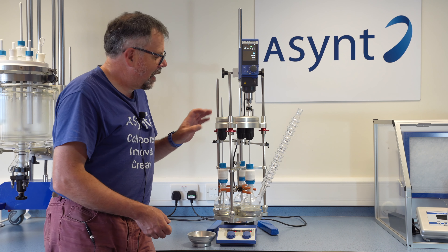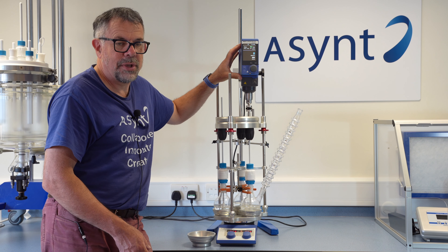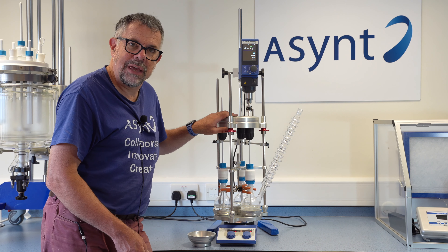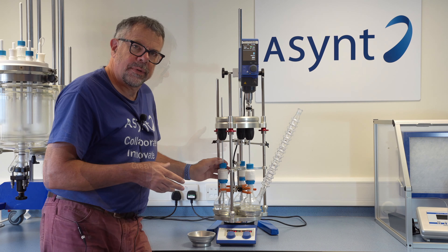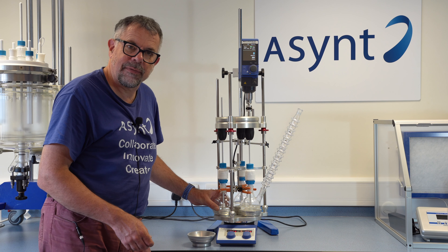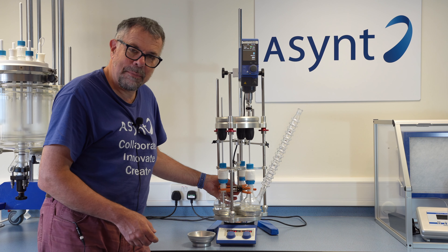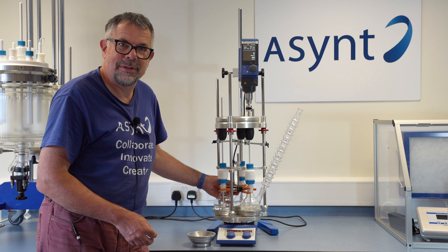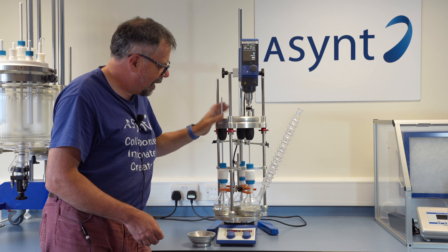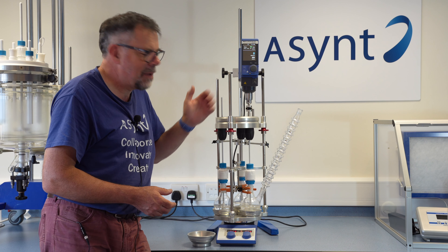The main thing about Vortex is it's a direct drive overhead stirrer. Basically, you can utilise a standard overhead stirrer motor, but instead of stirring just one reactor at a time, we have a heavy duty gearbox that allows stirring of three at a time. Vortex uses our standard PTFE couplings, standard PTFE paddles that fit through a standard round-bottom flask, a clamp the same as our standard multi clamp, and a completely standard overhead stirrer motor. The difference is the gearbox assembly, support stand — and from that you get high-power overhead stirring.